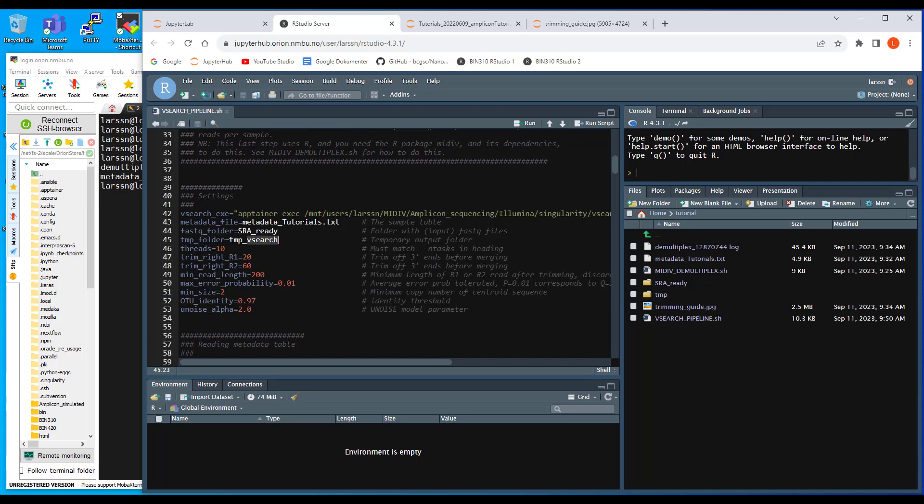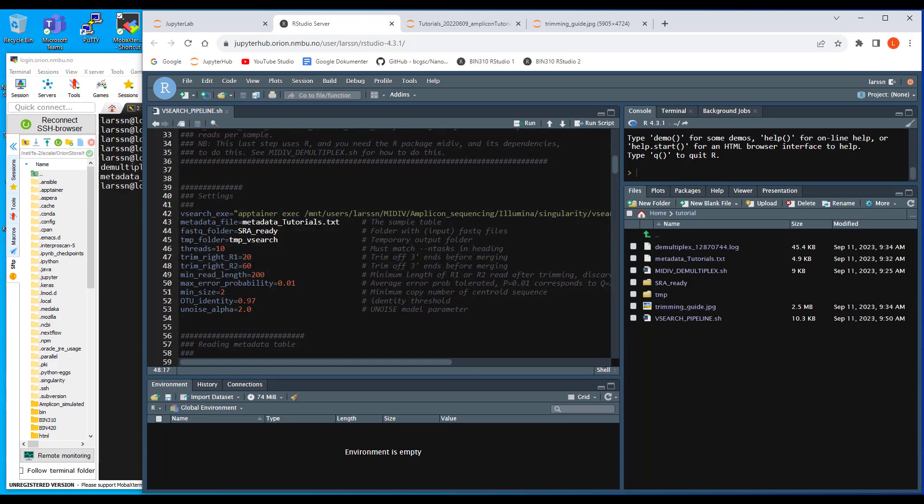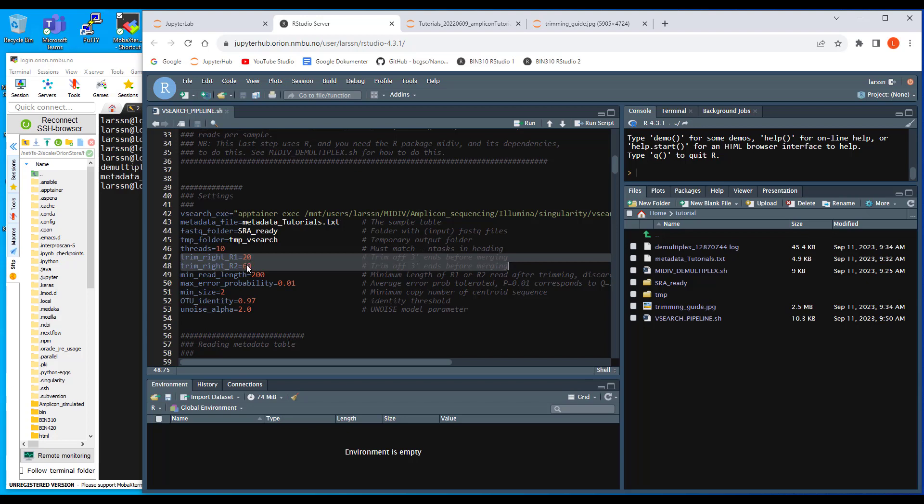And then the settings here, as I briefly mentioned in the demultiplexing, the trimming here is something you have to decide from data set to data set. Inspect the trimming guide here and see how much can you afford to trim. And you shouldn't trim maximum because if you really want to investigate this, you should actually try trimming different amounts of bases, look at the output, and not only how many reads are merged but how many are correctly merged. That's more tricky, but you can actually say something about it by looking at how many copies you get of the most abundant reads.